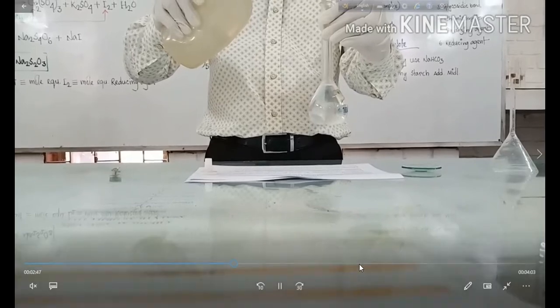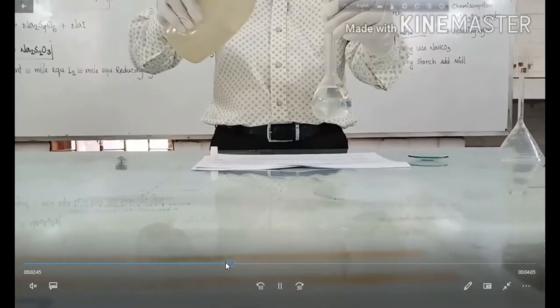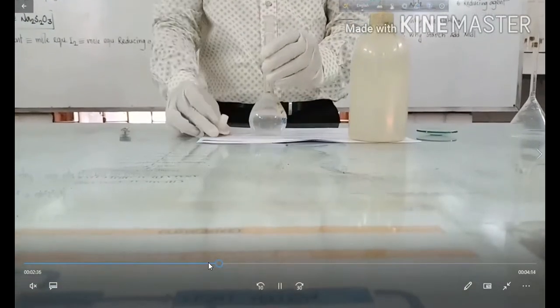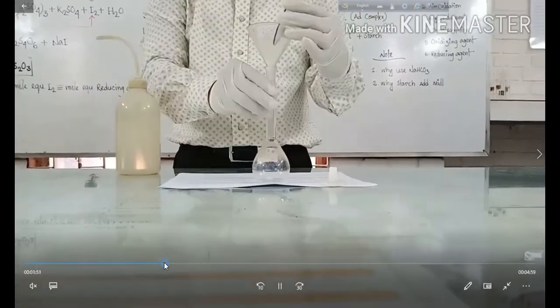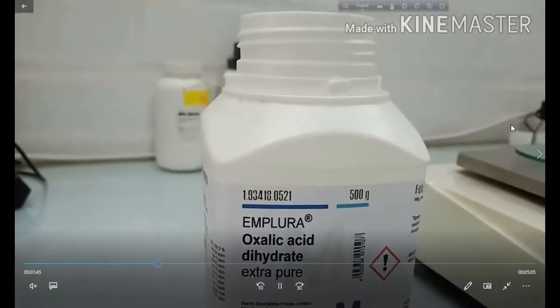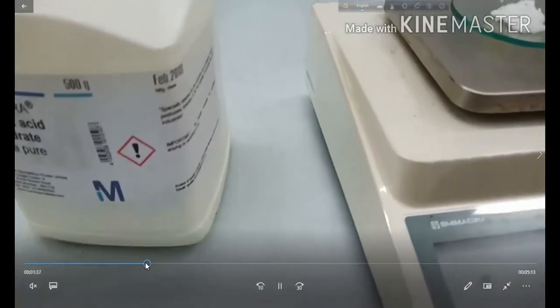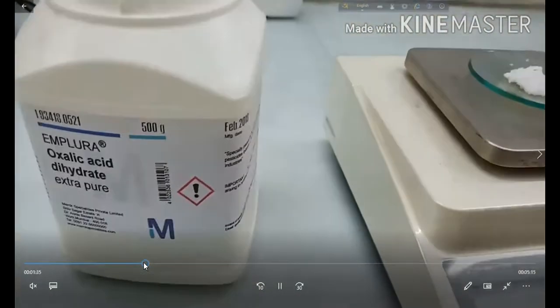Madam, was the spoon a spatula? Spatula, what are you saying? Where is the spoon we used earlier? The spoon. Was that a spatula? Yes. Here it is, the spatula. When you are taking some sample from the box, you have to use the spatula.